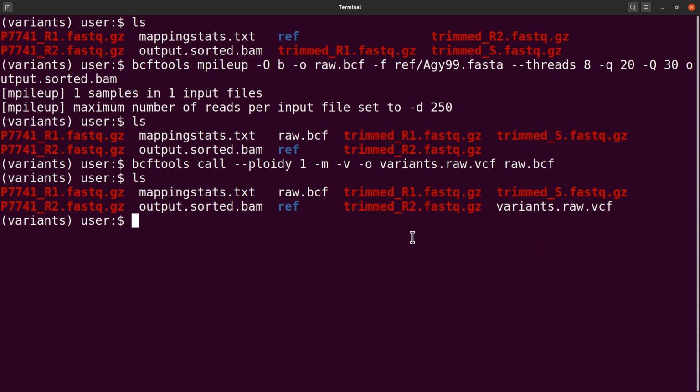So that's what you need to know. With the filtering aspects, these are things I'll cover in other tutorials. I currently have a playlist for handling VCF. In that playlist, I'll make another tutorial on how to filter variants, or how to filter the VCF files. So the filtering aspect of this variant calling will be done in another video. Now we have the variants here.